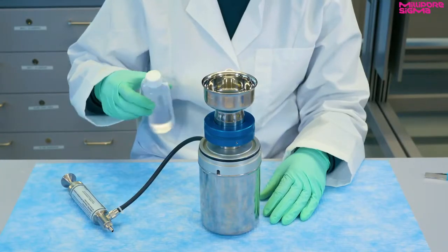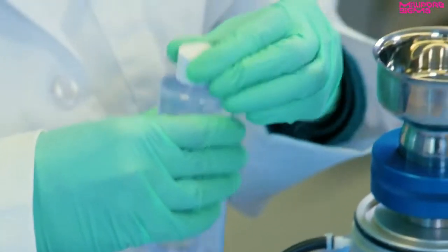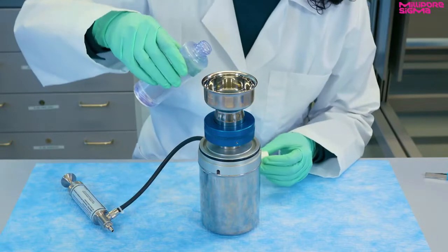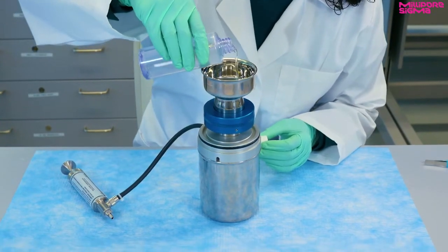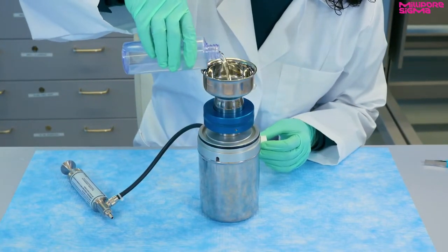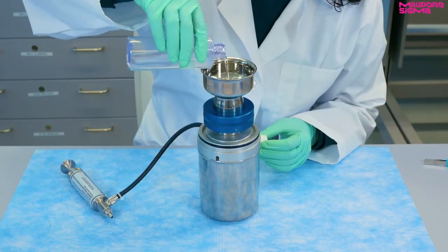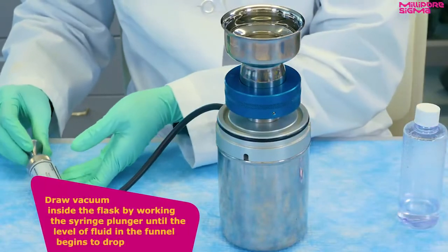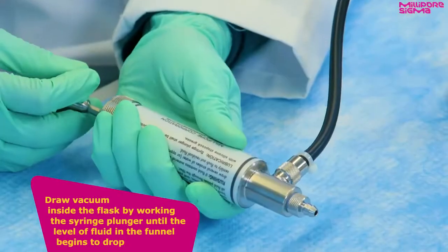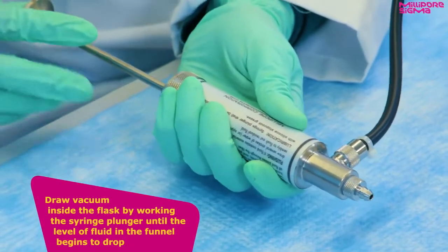To filter the test sample, first shake the sample bottle and empty the contents into the funnel by pouring against the funnel walls to distribute the fluid evenly over the surface of the filter. Next, draw vacuum inside the flask by working the syringe plunger until the level of the fluid in the funnel begins to drop.